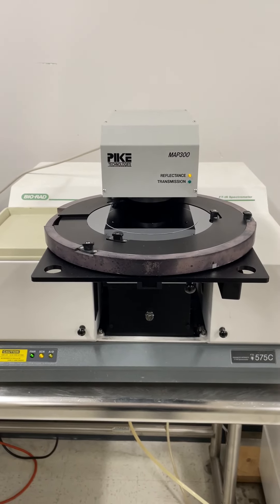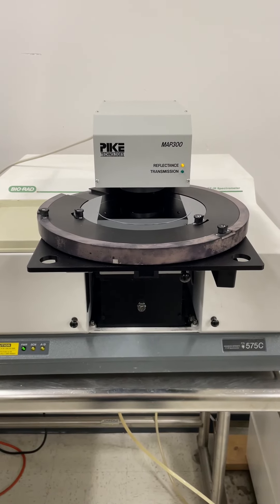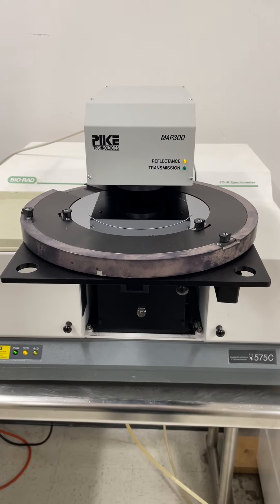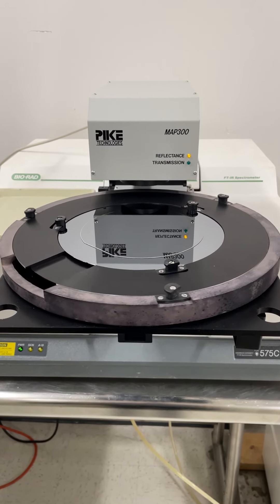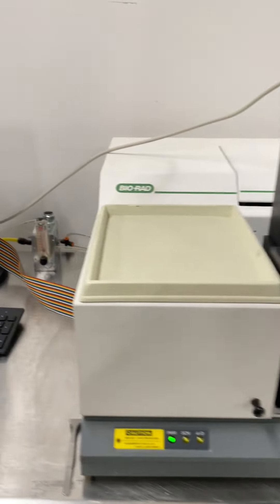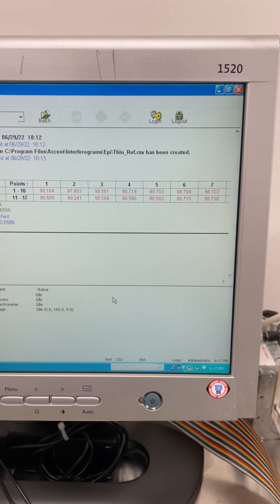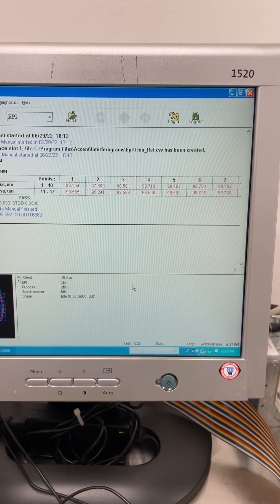One more to go — that's the last point. Then it will return the wafer to the load position with the flat or the notch facing out. There's our data. You can't see right now the 8, 9, and 10, but it's measuring very well.